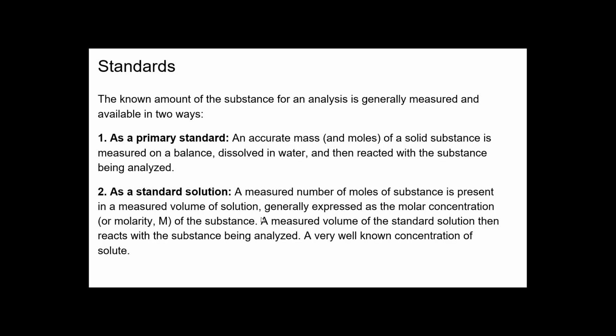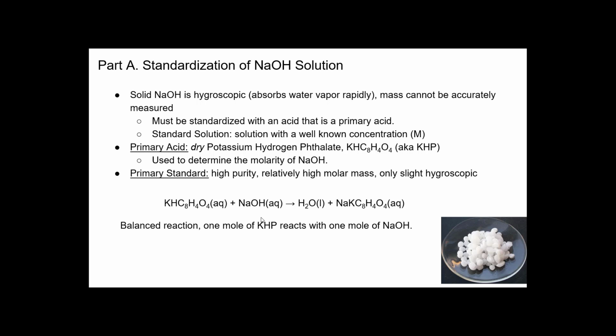What does this mean? Well, I'm going to explain this a little bit more as we get into the actual lab, and then this will make sense. So part A, standardization, there's that word again, of sodium hydroxide. Solid sodium hydroxide is hygroscopic. It means it absorbs water very quickly.